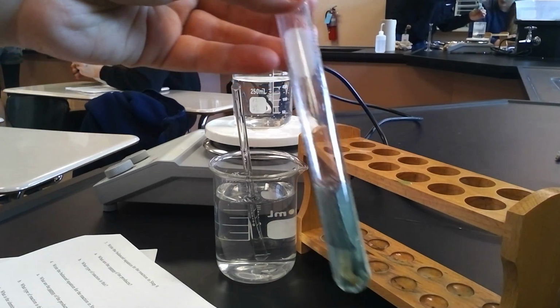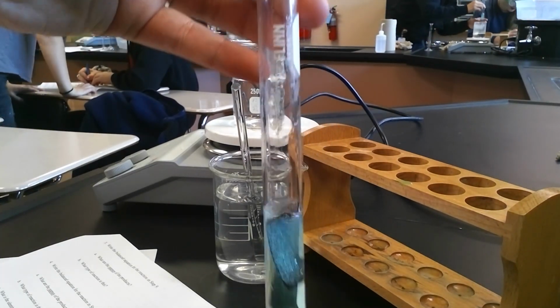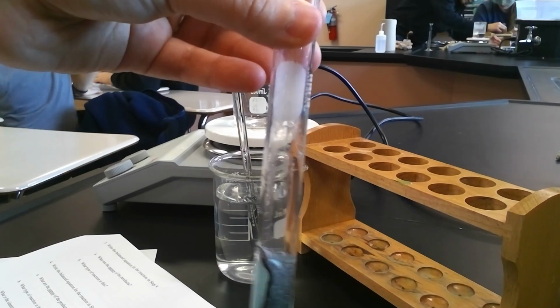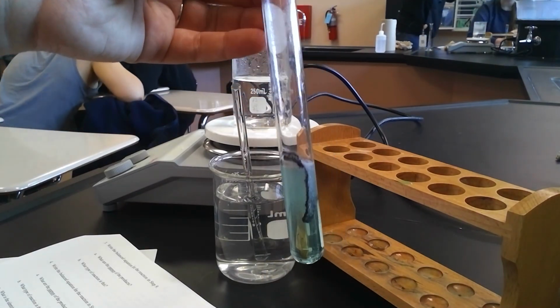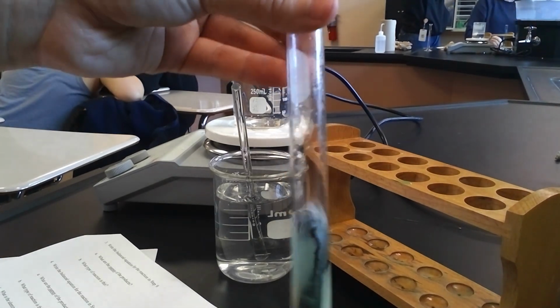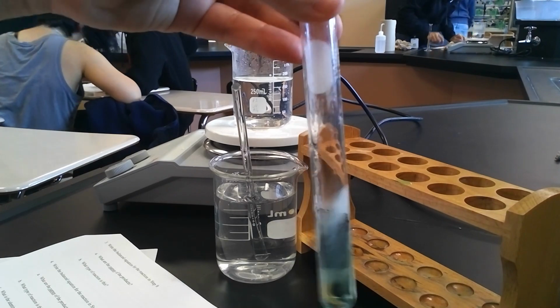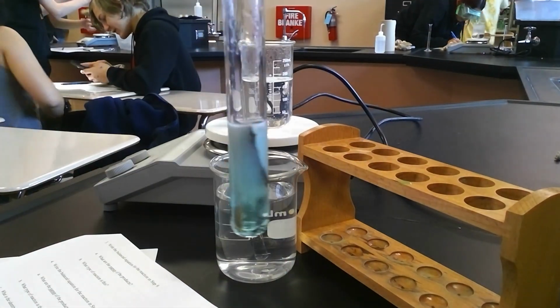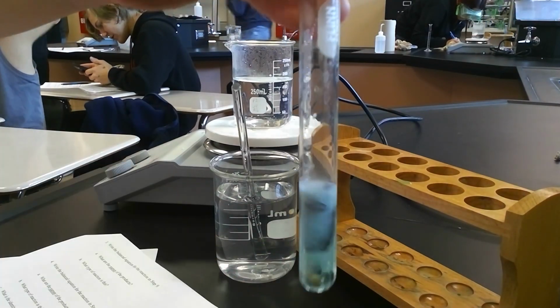But we also know that we have other substances that are still present in this test tube. So part of the reaction could be from that. Part of the reaction could be from other components that are a part of the aluminum foil, since we know that aluminum foil is not 100% aluminum. So in the directions it says to continue to swirl it, you can mix it and then tap the side of the test tube with your fingers to kind of knock the stuff off of the aluminum.